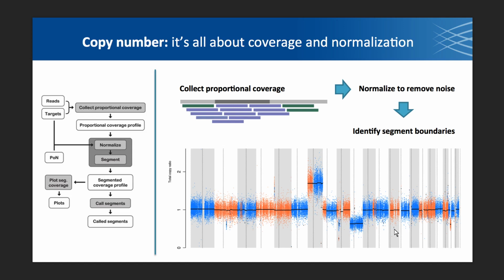So this kind of goes back to the diagram that we looked at in the earlier slides where we had the homozygous deletion, the hemizygous deletion, and we looked at the number of reads that would be associated with each of those. So you expect to see, if you have a normal section of the genome, the coverage will be pretty consistent. If you have a hemizygous deletion, you expect it to fall by about half. If you have a homozygous deletion, you don't expect to see any reads there. And that sounds like a really easy case, right?